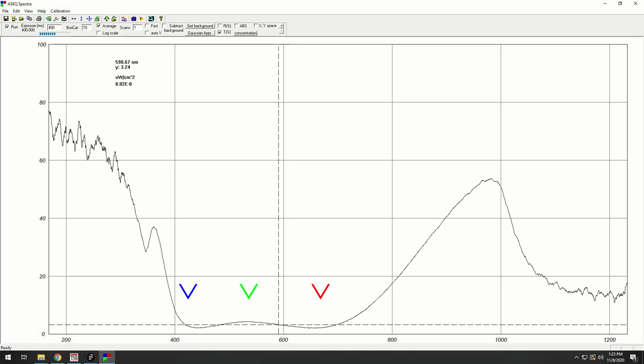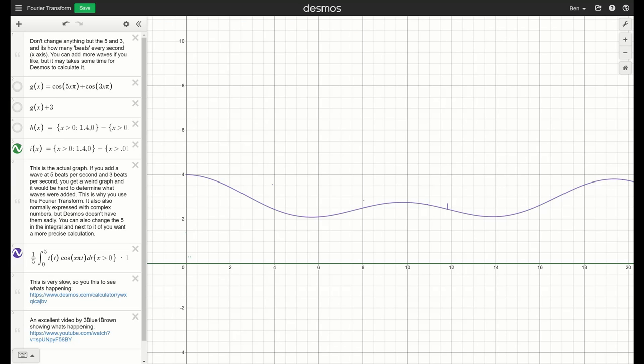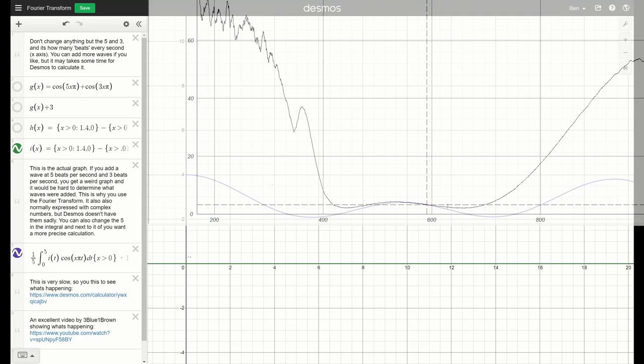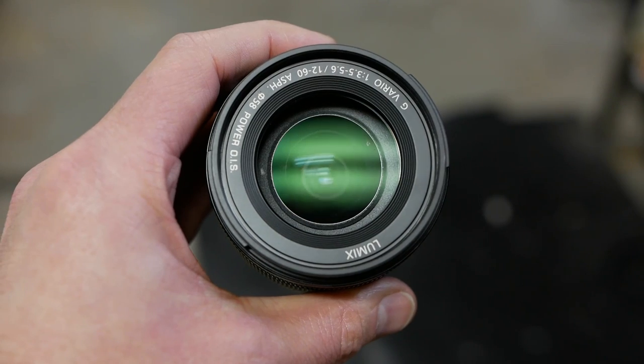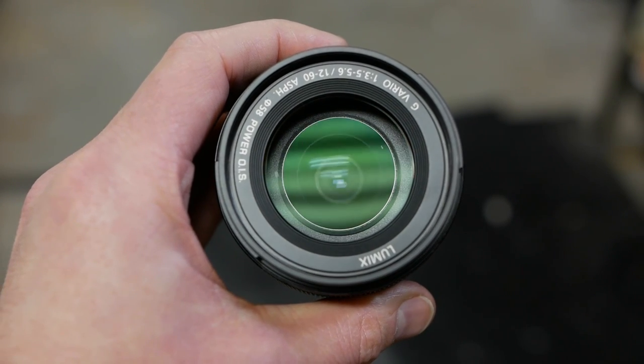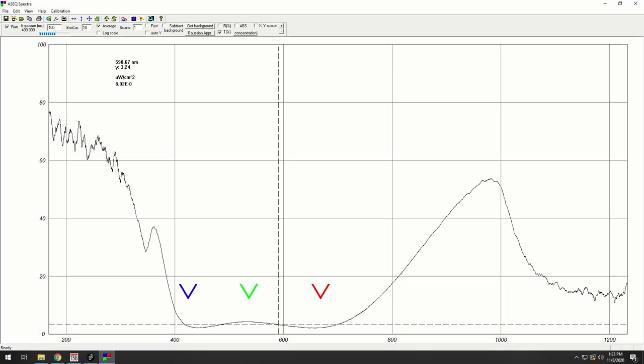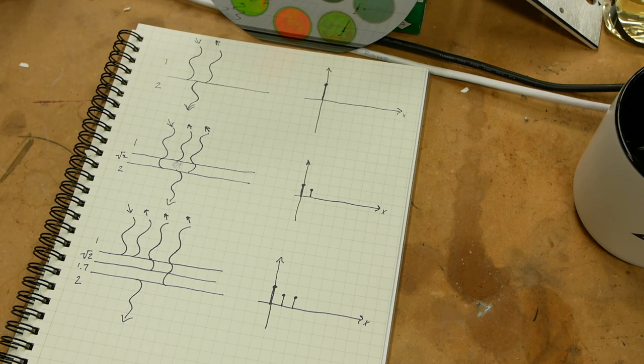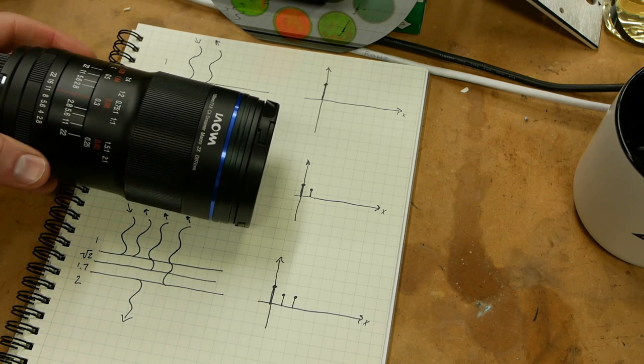And sure enough, if we look at a green multi-coated lens with the spectrometer, we see that it has this double dip pattern where there's two frequencies that have anti-reflection properties. And sure enough, if we plug this back into the mathematical program, it has exactly the same shape to that response. And it looks greenish because there is, in fact, less red and less blue light compared to green in this case, because now we're correcting frequencies in the red and blue area, but we're not targeting green this time, so a little bit more green comes through.